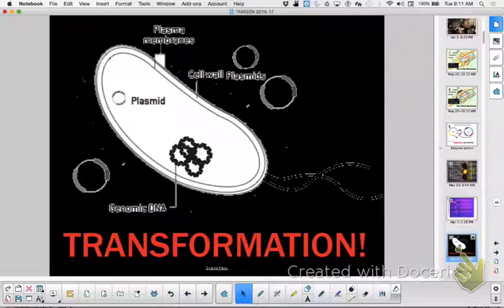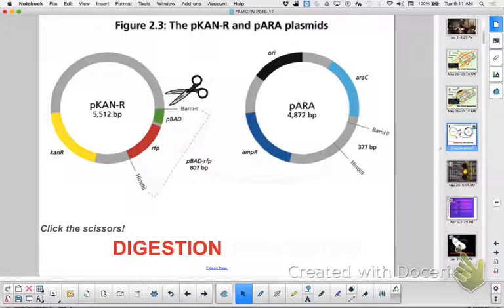Restriction enzymes BamHI and HindIII each cut at different recognition sequences. Both plasmids have recognition sequences for the enzymes. And then I said, why 2 sites? Let me go back to that again. Why do we have 2 cutting sites? Why didn't we just use 1 restriction enzyme? I wanted to cut in 2 places, but again, why couldn't I just use the same restriction enzyme and have it have 2 recognition sequences that are the same?